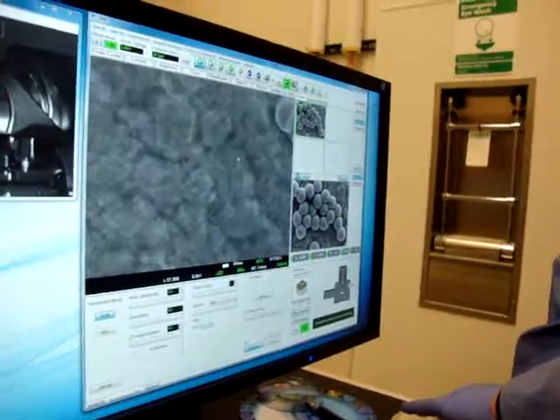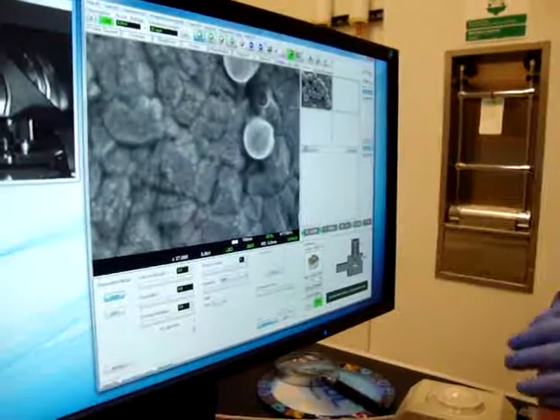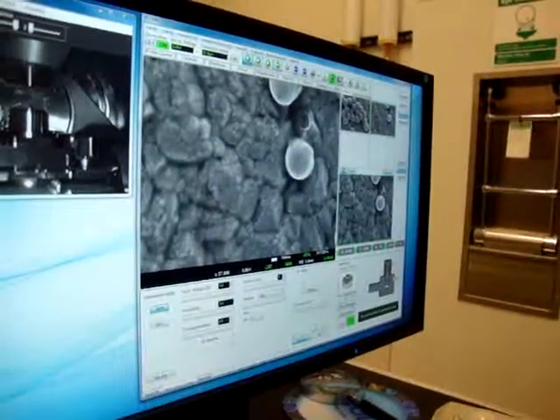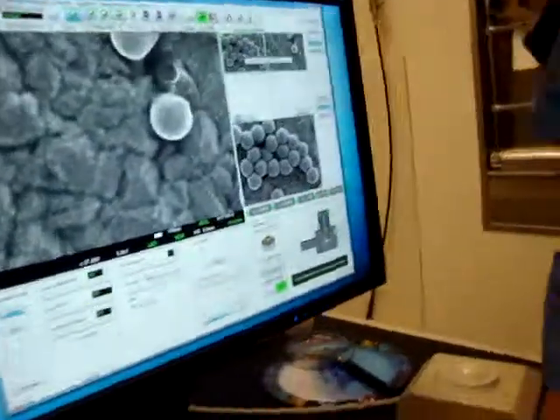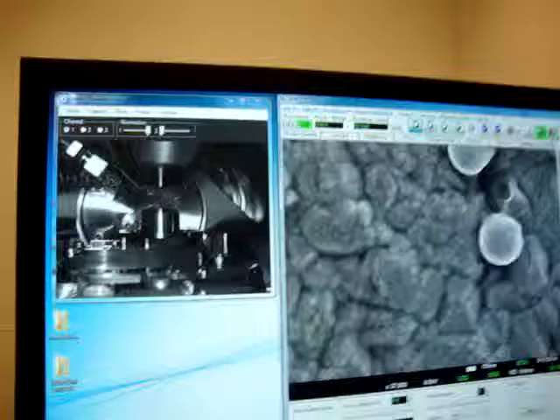Okay. Snapshot again. Okay. So now if I want to go back to that, I believe it's move. It's still here. Yeah, no, we're still on this picture.